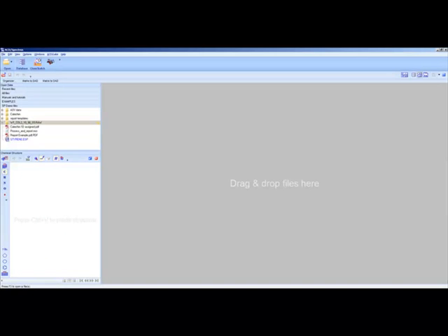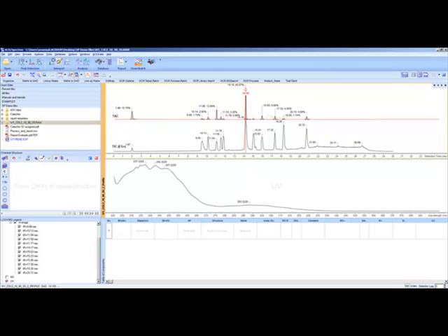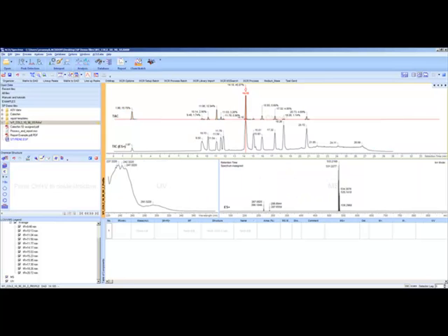But as we mentioned, Spectrus Processor is not just for NMR. An LCMS data file can just as easily be processed. Again, I merely drag over the directory and the software opens the file. Note that the icons have changed in a context-specific manner, but the overall layout remains the same, making the software user-friendly. The LC-UV-MS legend on the side allows the user to customize the view. The lag time between detectors can automatically be adjusted for or manually edited here to align the peaks.